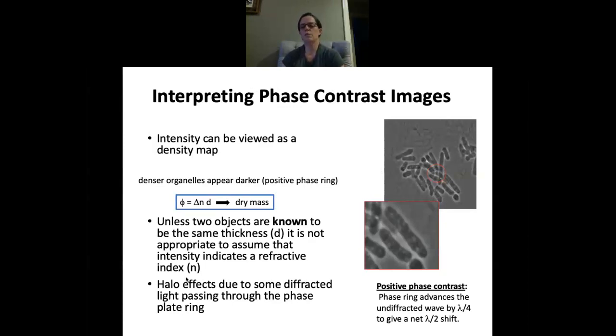Analysis and interpretation of phase contrast images, whether they're created using Zernike phase contrast or any of the other phase contrast methods I'll speak about, require keeping in mind the particular method of contrast formation. The difference between positive and negative phase contrast is an example. You can consider the product of the thickness of the sample and its refractive index to be the phase of the cell, since this is the value that delays the wavefront.